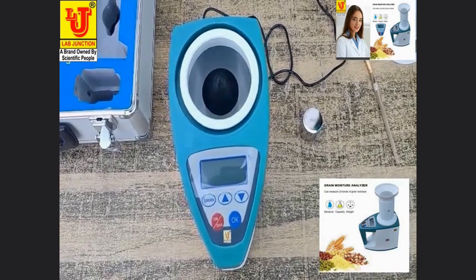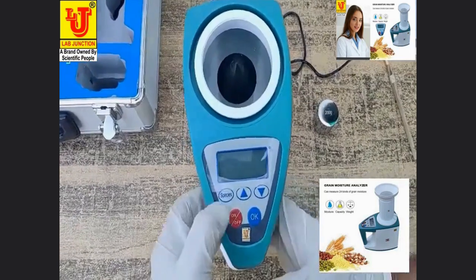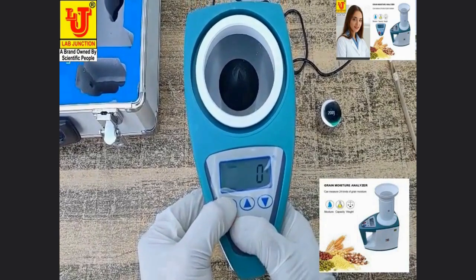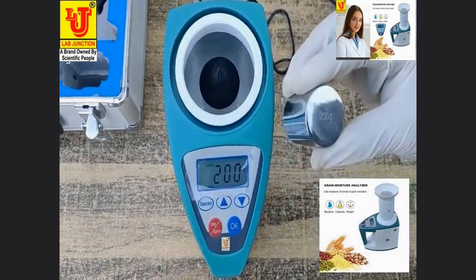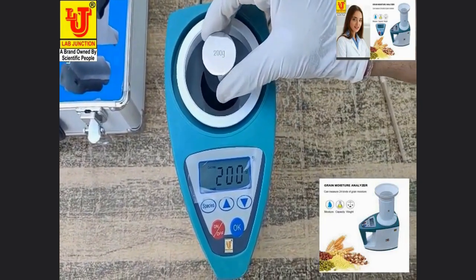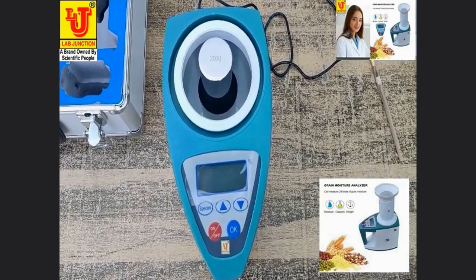Doing calibration of the grain moisture meter. For calibration, first press the Species key and switch on. It shows 200 grams. Now take this weight of 200 grams, put it on the sensor, and press OK. Calibration done.